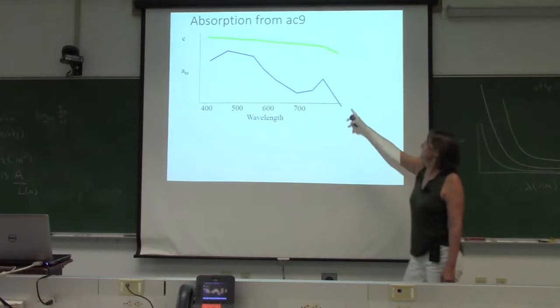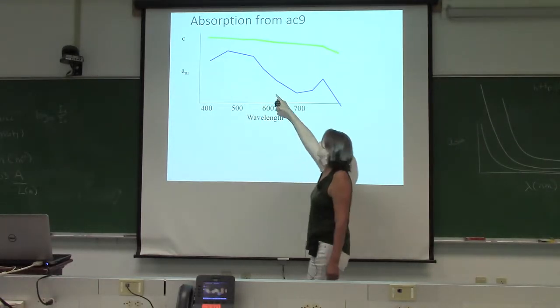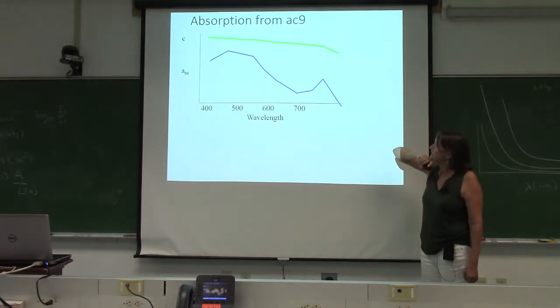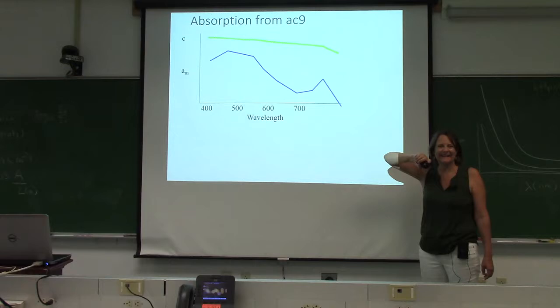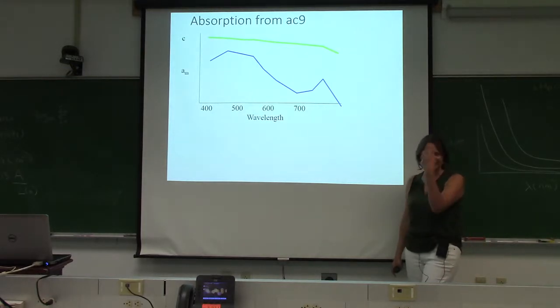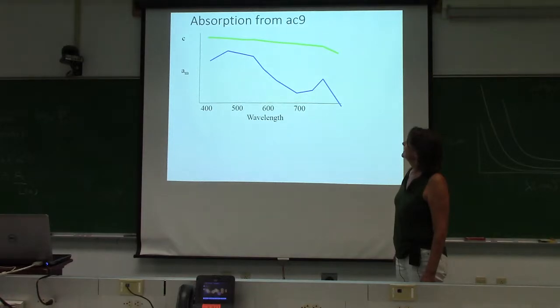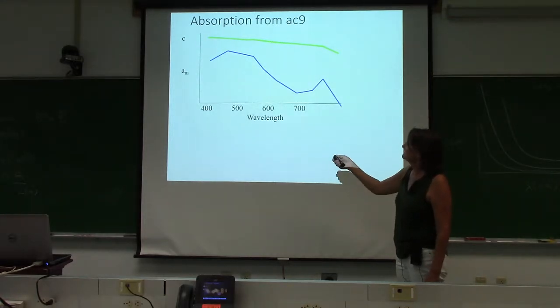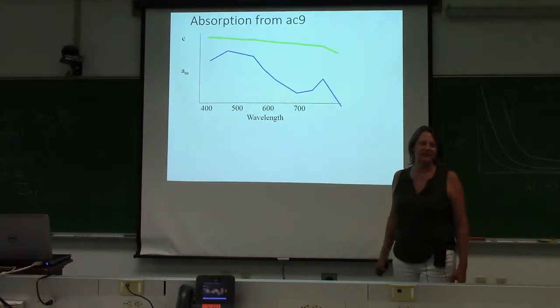Looks like phytoplankton. I have a nice peak here and a peak here. There's probably some carotenoids that Ivona was telling you about. Is it ready to publish? Why? Because Skylar's got... I don't know, the peaks just don't line up with the wavelengths that you'd expect. They may not line up where they expect. Maybe, and again, these are only 410, 440, and 555. So you might be missing a bunch of stuff in here because it's only 9 wavelengths.